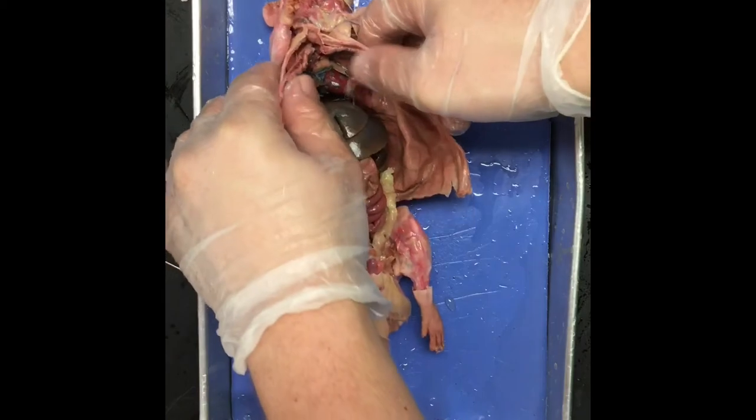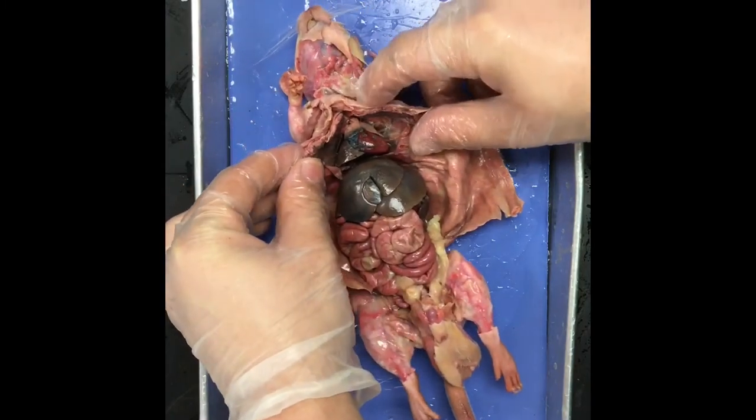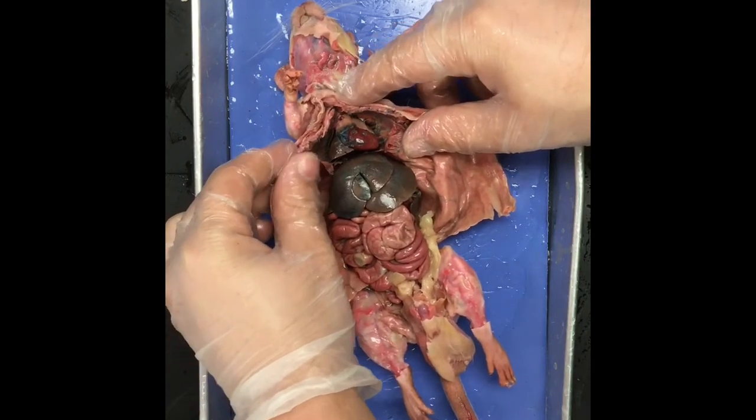Listen. It looks like a tiny strawberry. So, first things first, which is your cardiovascular system. I see the heart. And your respiratory system. Everywhere you're seeing red and blue is latex, which means those are arteries for the red ones and veins for the blue ones.